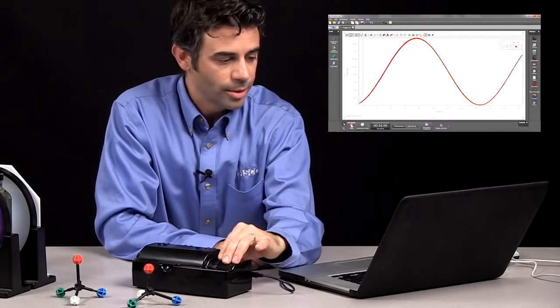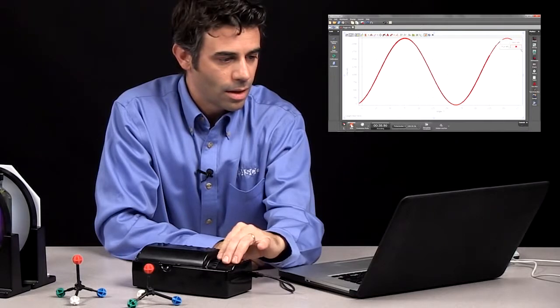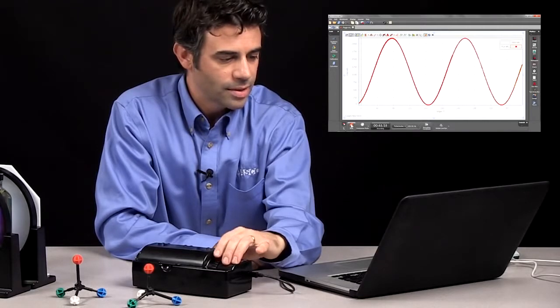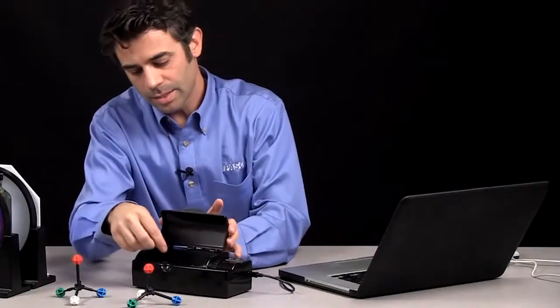I'm going to spin it around a little more. And there we go. A couple of cycles through, and we got through our 360. And I'm just going to hit stop now. So now I'm going to take this sample out.